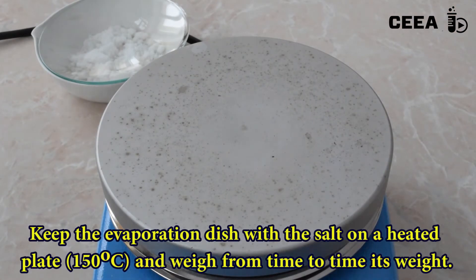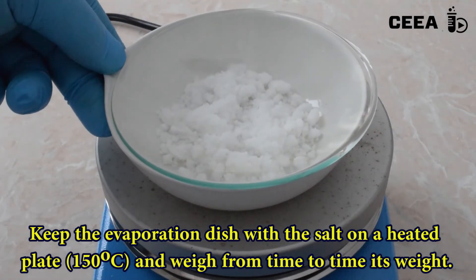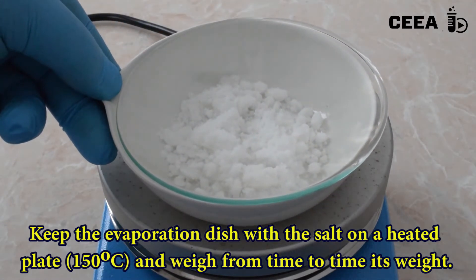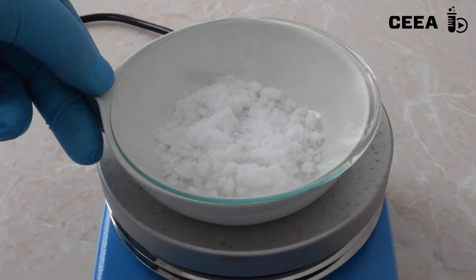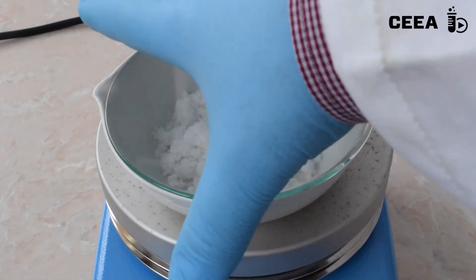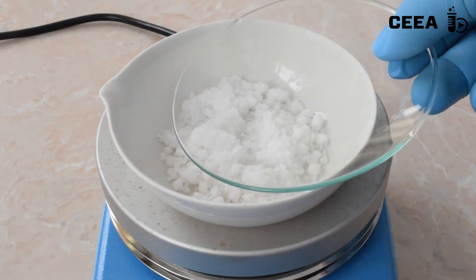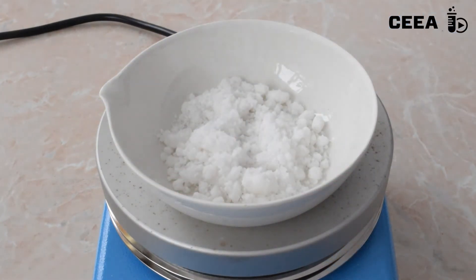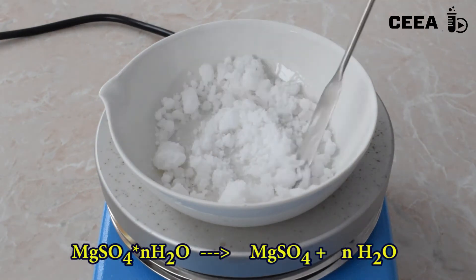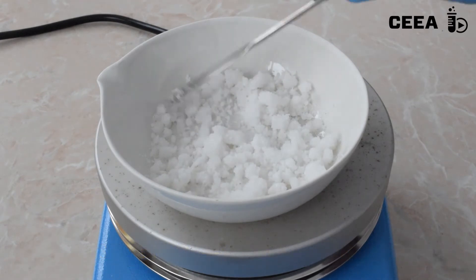Heat the content of the evaporation dish on a heating plate at 150 degrees Celsius. Mix from time to time to allow all crystals to be in contact with the hot dish.